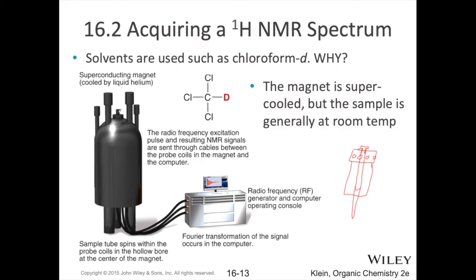Once you rest your NMR tube with this spinner on top, it bobs up and down on this column of air. When you click insert, it lowers the air pressure very, very gently, and your sample gradually slides into your NMR machine. Okay?